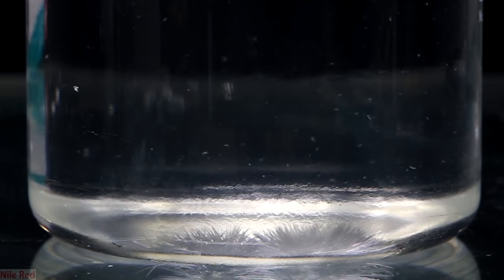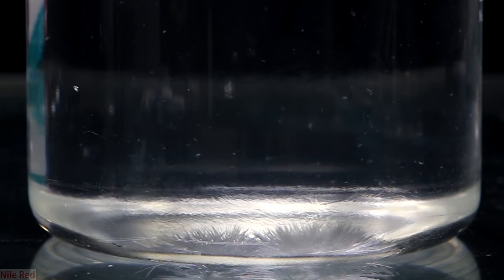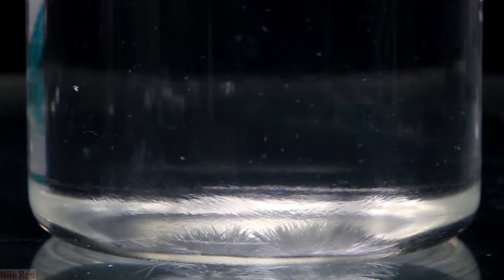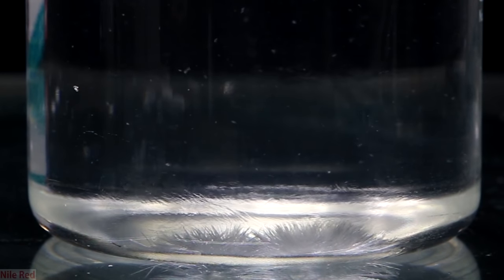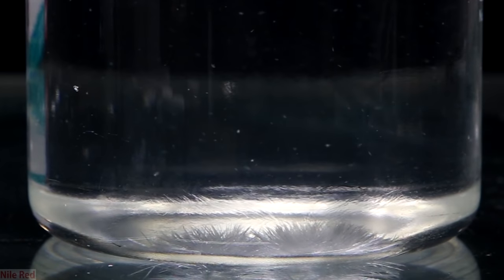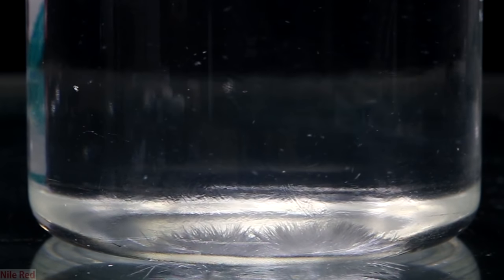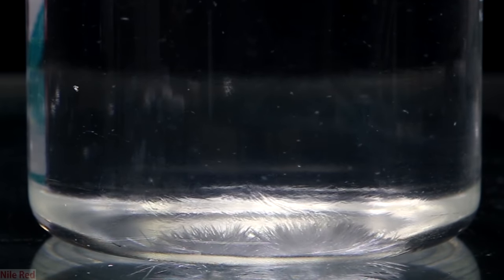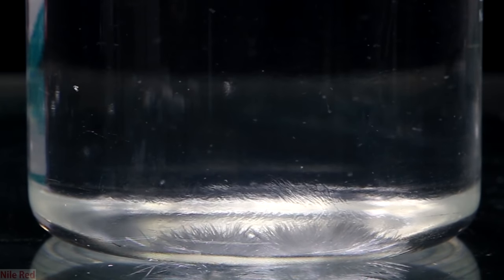After letting it cool for a little bit, some crystals will start to form. As the solution slowly cools, the solubility of urea will slowly decrease. As this happens, urea will slowly precipitate out of solution and will form crystals. At first it's slow but as time goes on more and more crystals will appear.